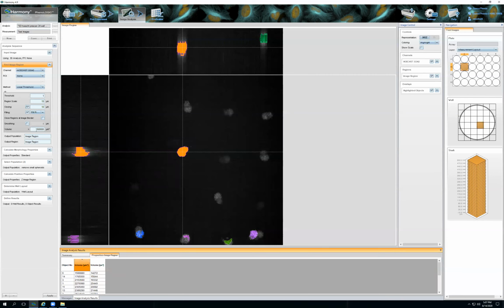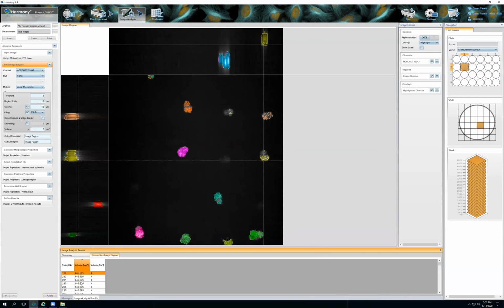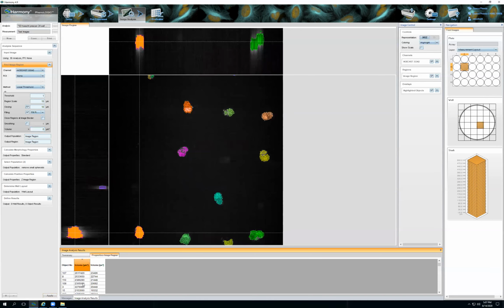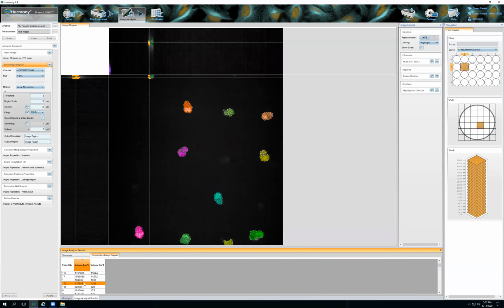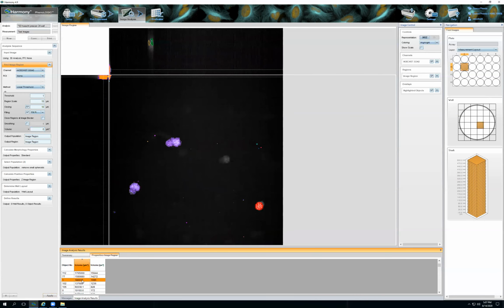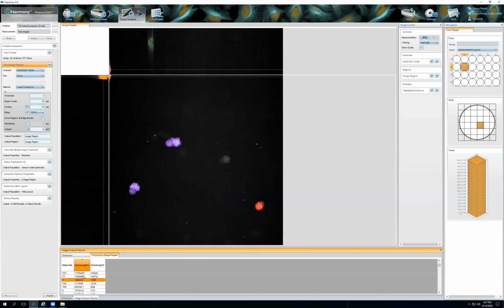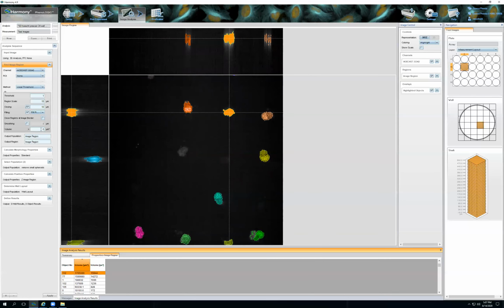So if I had this at 0, I could say, okay, these ones, when you click on it, it's going to bring you, these are all not what I want, or you can go from the opposite direction. You can say, okay, that's a spheroid. So where does it go from spheroids to not full spheroids? These are partial spheroids on the edges. So you can say, okay, well, this one's getting closer. So you can make a cutoff based on what is detected and what you want.